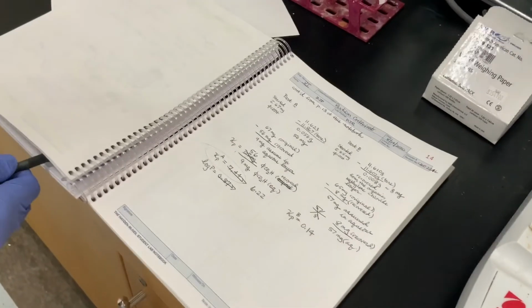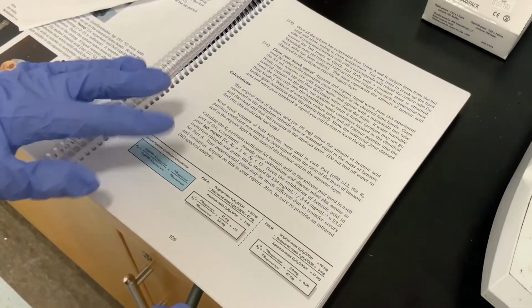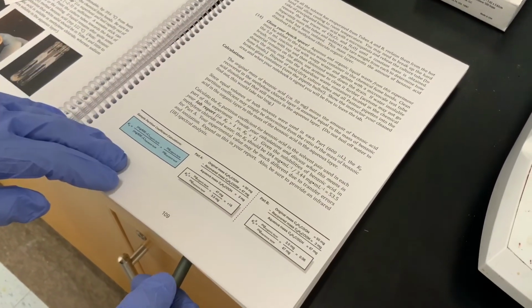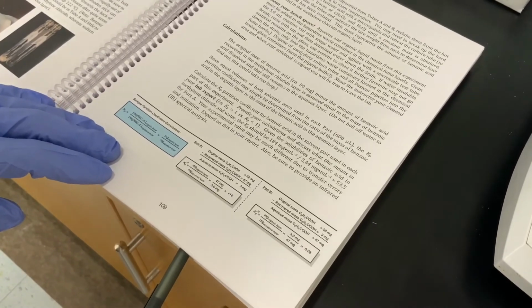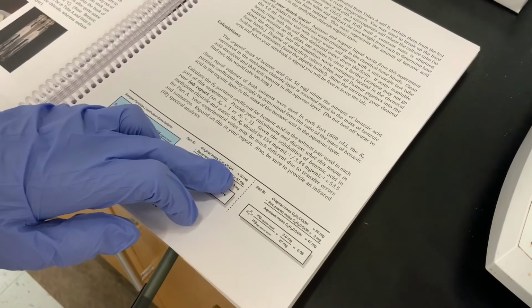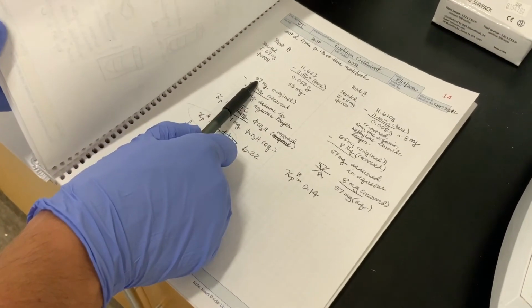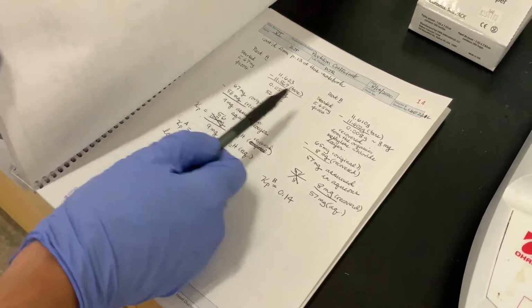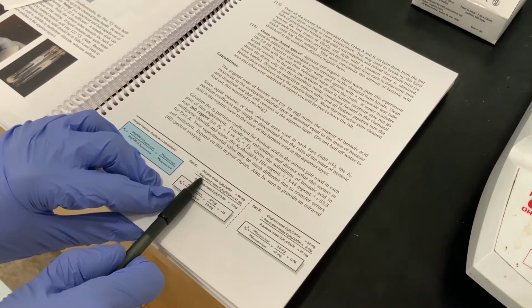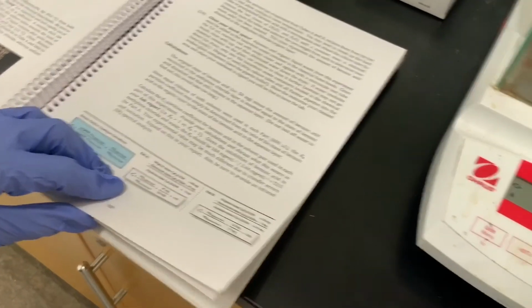Okay, so in order to calculate the partition coefficient, we look at the calculation in the lab manual. And so we need to know the original mass of the benzoic acid that we had started with. So for example, in part A, we had started with 67 milligrams. And from that, you subtract the amount of benzoic acid recovered in this culture tube.